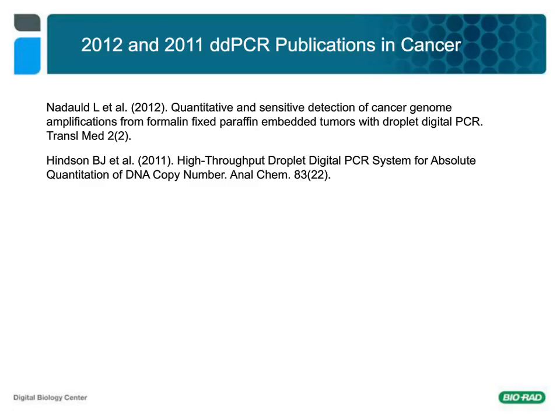What's your confidence in calling that a true positive? That becomes a game of knowing how many negative controls you had to measure what your confidence level in that single positive would be. But as 3.3 picograms of genomic DNA is typically one haploid genome, you can detect just one haploid genome.